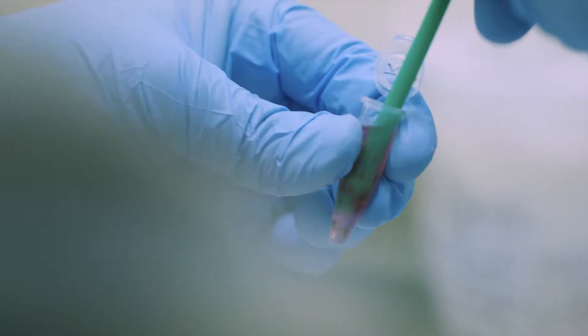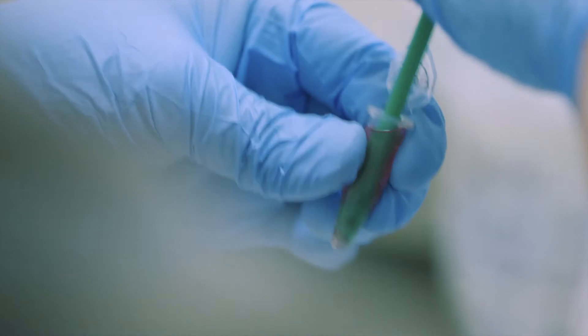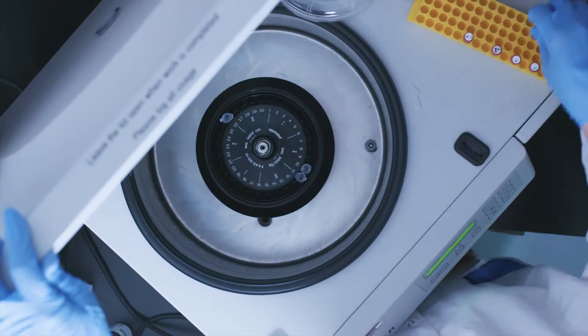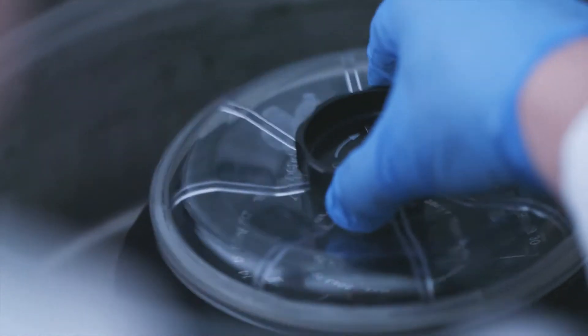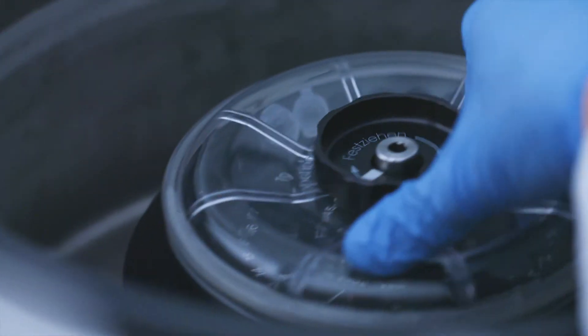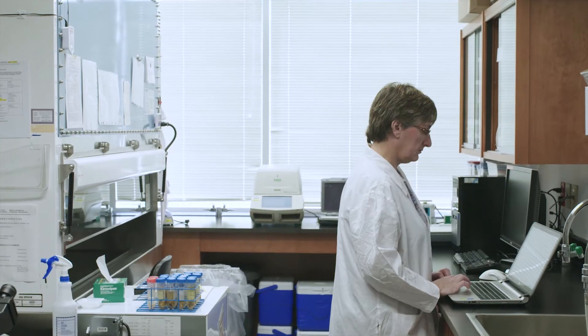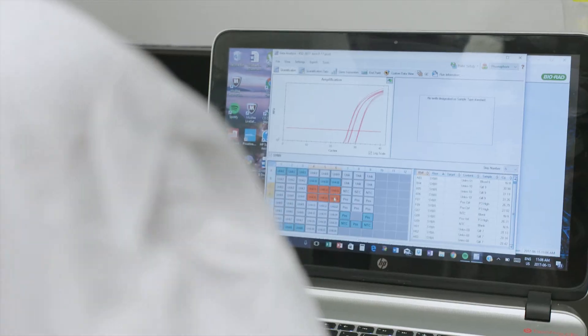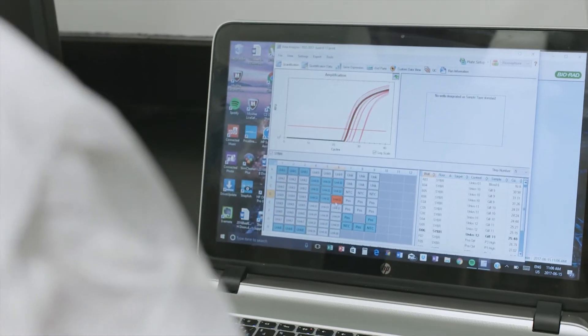We harvest tissues and then we will analyze those. First we have to extract the RNA or the DNA from the tissue, and then we will take that and amplify it to make it large enough that we can detect it using a machine.